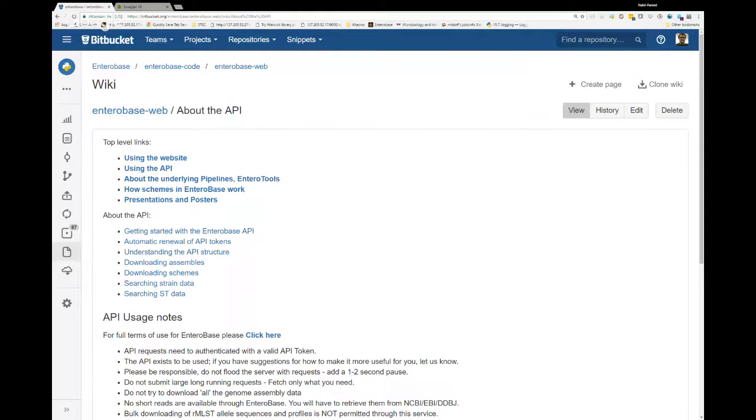Yeah, I'm not sure if there's a sensible way we can store and serve that information without a lot of work. And I'm not sure if people want that. If you want the ability to recall a state of the database at any time, please get in touch. We do keep timestamps for all of the records in the API, but just having a blob like that, we don't do.